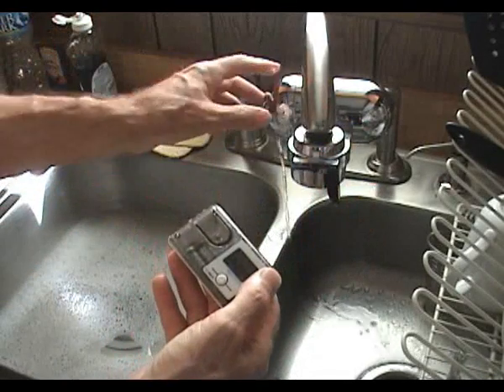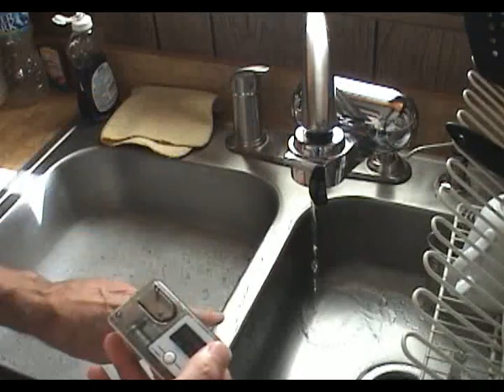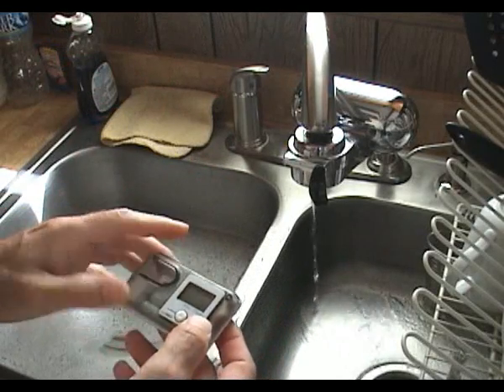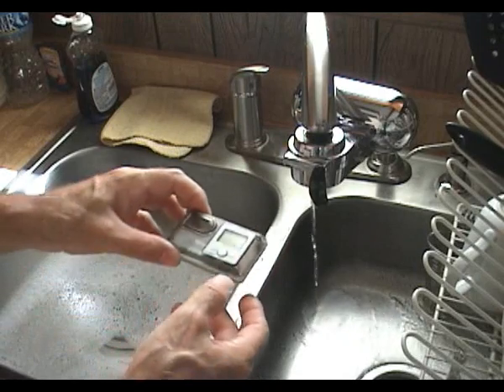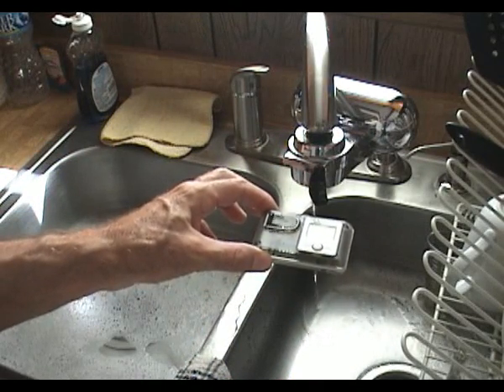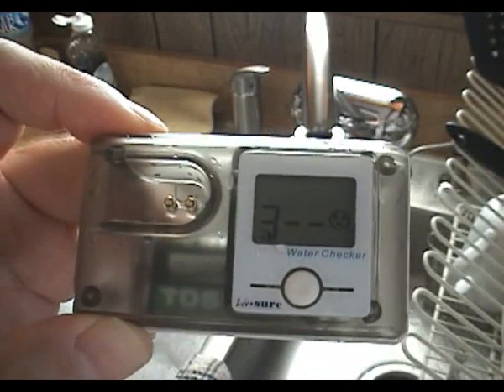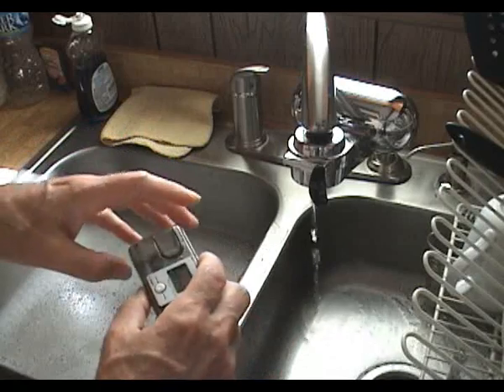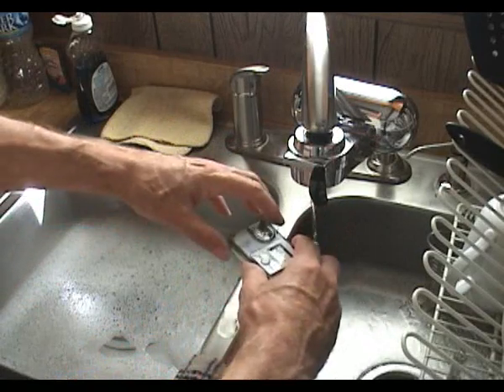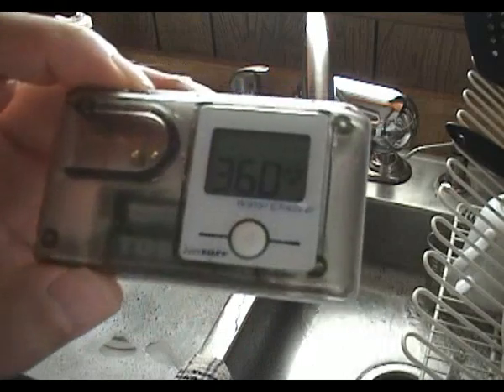Now we'll flip the valve and run the water through the water filter. This particular model has a little light that blinks green if the filter is good, and it did blink green. We'll let the water run through the filter for about five seconds as per the instructions. That's been more than five seconds, so we'll now fill the well with water from the filter, press the Go button, and wait for a reading. There's my beep, and the reading is 350. Let's take a second reading — rinse the well, fill it up, press the Go button. The reading has gone up to 360.